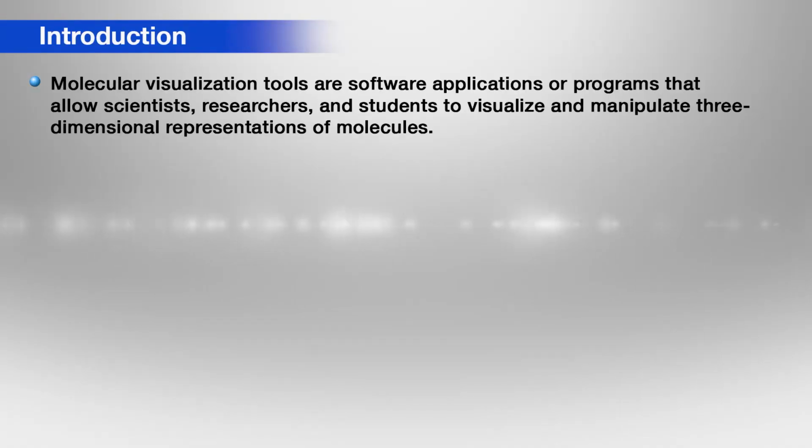One goal of this lecture is to allow you to become familiar with the program so that it will be useful for the study of a variety of macromolecules. Molecular visualization tools are software applications or programs that allow scientists, researchers and students to visualize and manipulate three-dimensional representations of molecules.